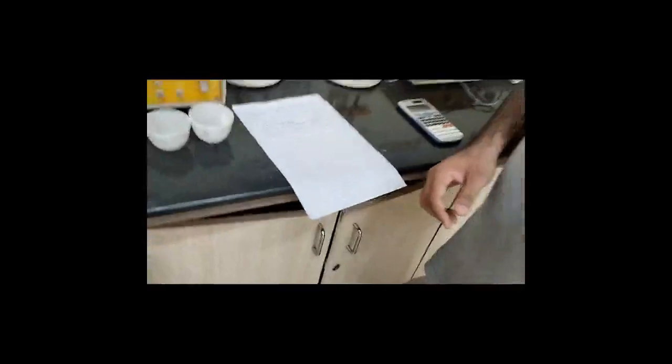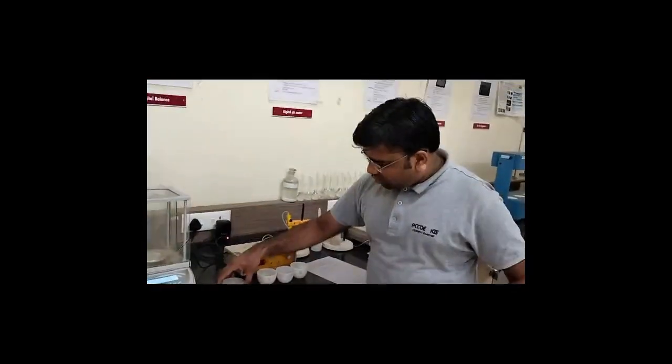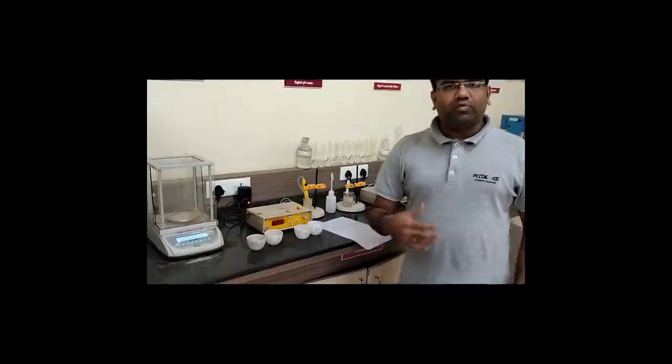So for the total solids experimentation, the empty weight of crucible A was this, and the final weight after the evaporation we have got is this. Similarly for crucible B, it has been given. Same for the total dissolved solids, you can see crucible C empty weight and final weight have been given, and crucible D empty weight and final weight have been given. So what we are going to do next is keep the crucibles of the total solids into the muffle furnace, and we are going to perform the experimentation for finding out the total volatile solids.